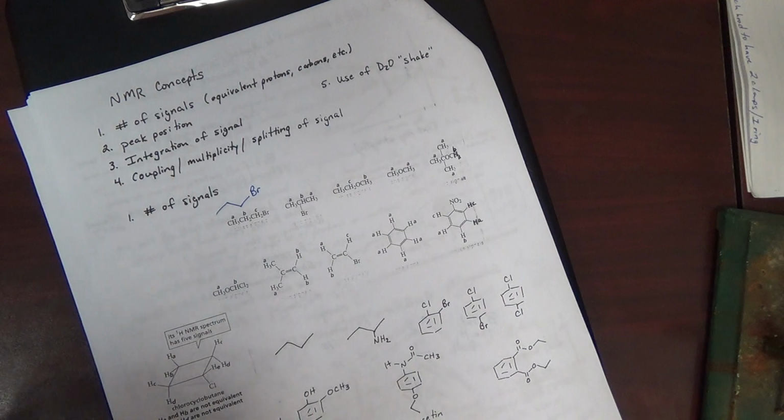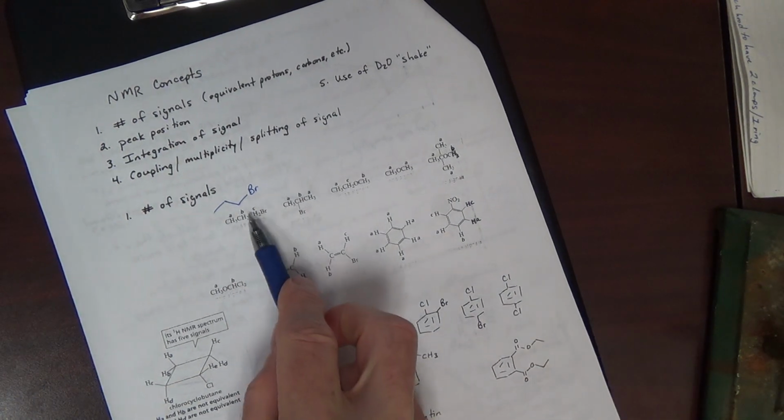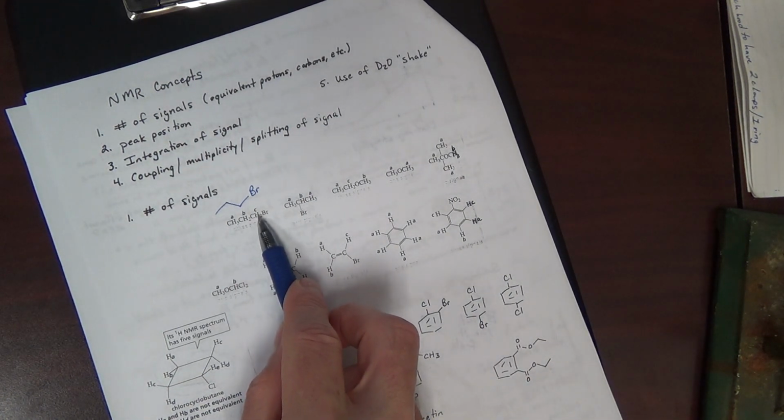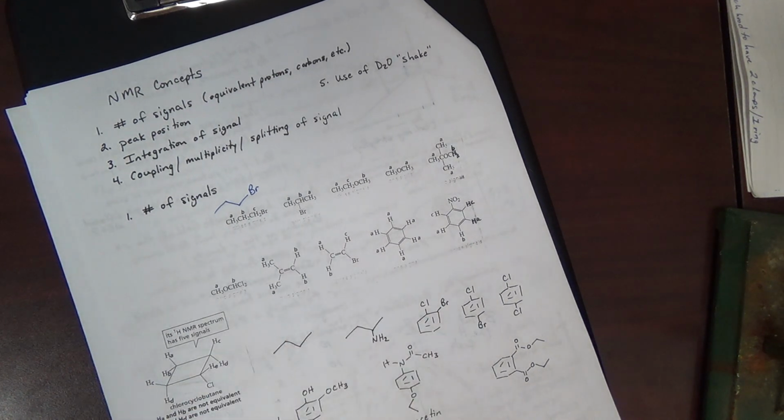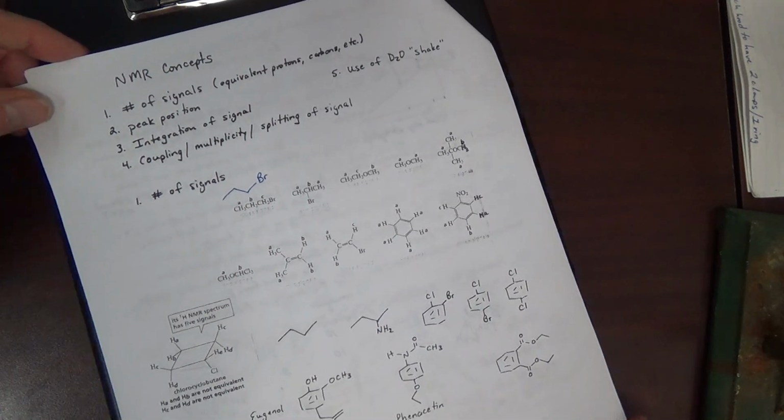So that bromine sort of takes away some of the sunscreen from the CH's. It doesn't allow those electrons to sit here as much to shield. So the bromine serves to de-shield. Okay, that's just a little bit of review and also sort of foreshadowing.